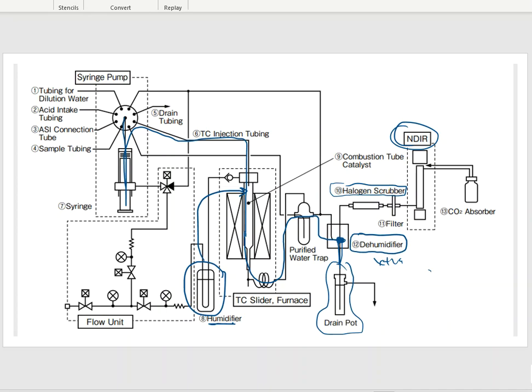And that's the dehumidifier's job. It's got to remove the extra moisture that's in my sample throughout the analysis runs. So that dehumidifier will take out the extra moisture, and of course moisture is water, and it's got to go somewhere, okay? So this water vapor is going to condense down, and when this thing begins to condense down into a liquid, it's got to have somewhere to go.